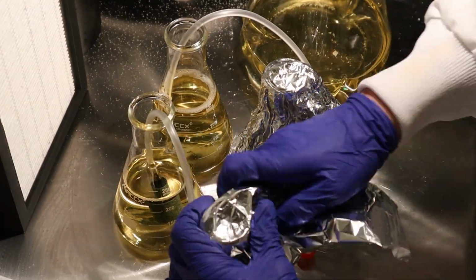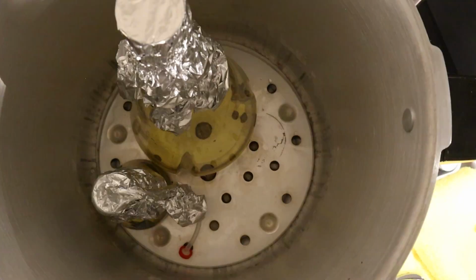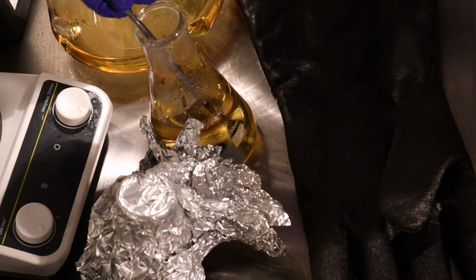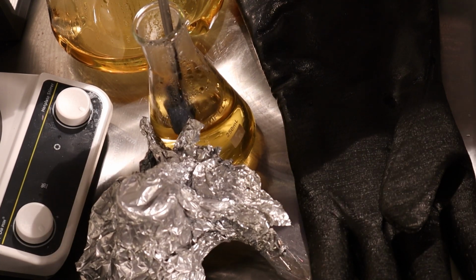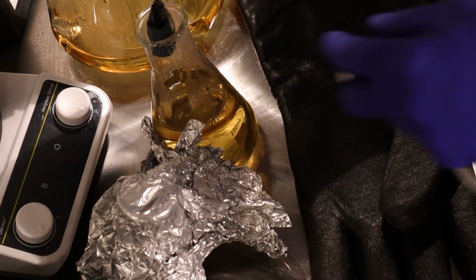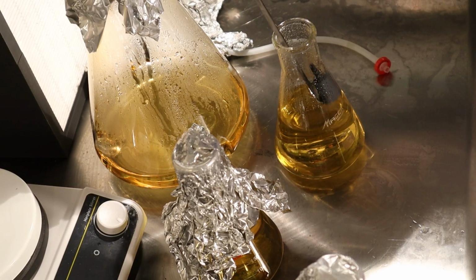The autoclave turned out to be a real pain, because every time I ran into issues with airstone assemblies pieces falling off and having to scoop it out and autoclave again. I ended up having to autoclave a total of 4 times, and because of the high flask volume, they lost a lot of their media during the autoclave, which I didn't care much about, to be honest. I just didn't want to autoclave anymore.